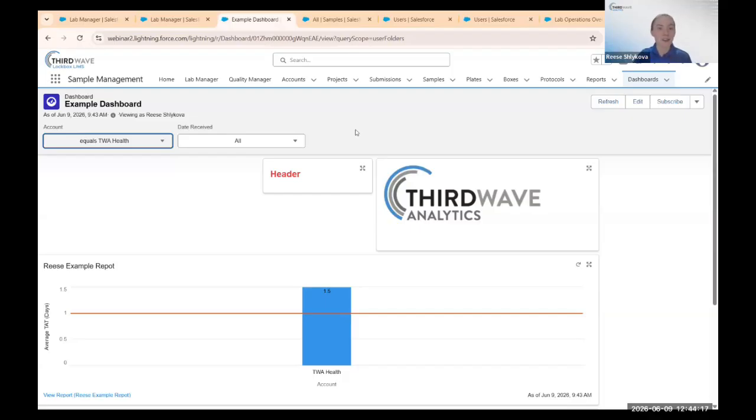So I am going to stop at this point because we wanted to give about 15 minutes now for Q&A. I haven't looked at the chat yet, but it looked active.